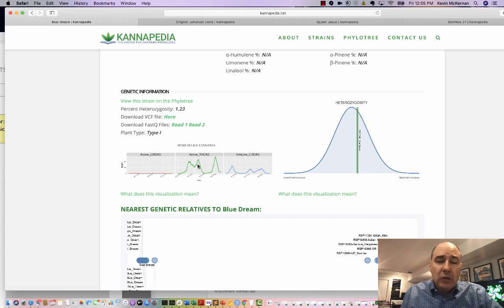This happens to be in very close proximity to this. And so we're only tracking this CBD synthase as a confirmation of this marker, and to also try and track how large this deletion is. What we tend to see in most genomes is full deletions of the CBD synthase gene or full deletions of the THC synthase gene, and it usually embodies this neighboring cannabinoid synthase gene as well. All right, so this is a little bit redundant.